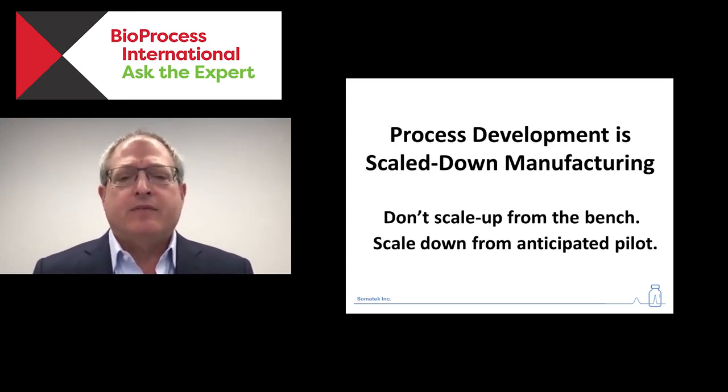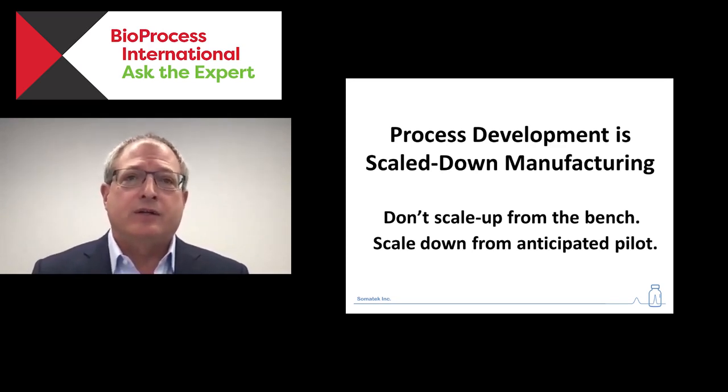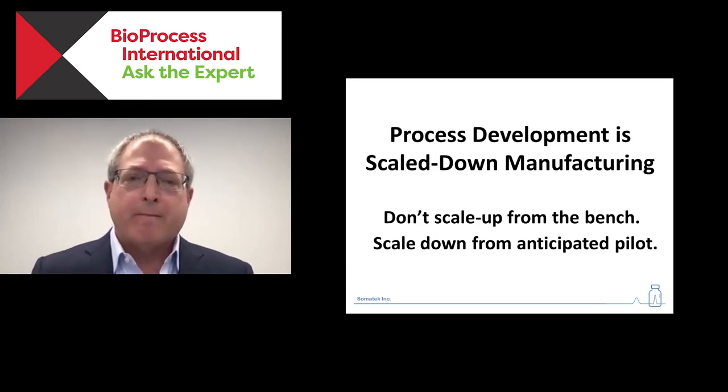And I think if there's one take-home message from this talk, it should be that process development is a scaled-down activity. At Somatek, we work with researchers, CDMOs, pilot facilities, manufacturing facilities, and one of the common problems we see is that there's often a scale-up mentality. People work out something at the bench and then they try to scale it up, and that leads to a number of problems. And I'll try to keep visiting that as I go through this talk.